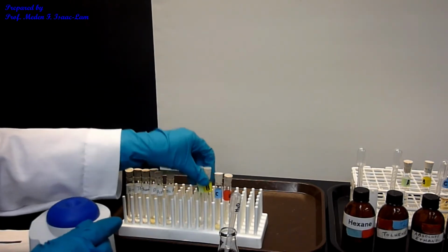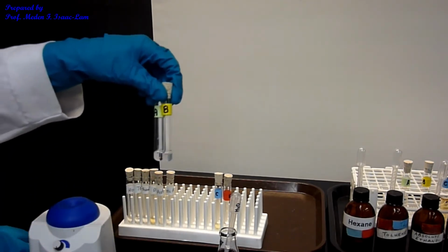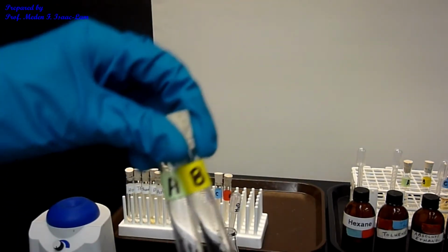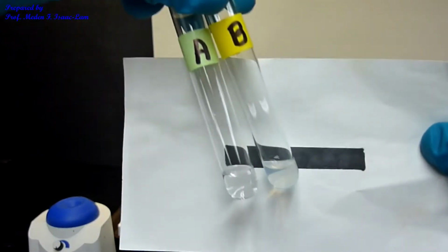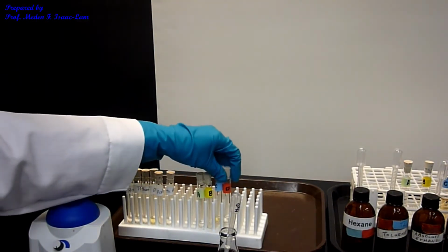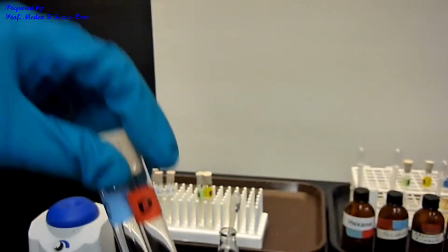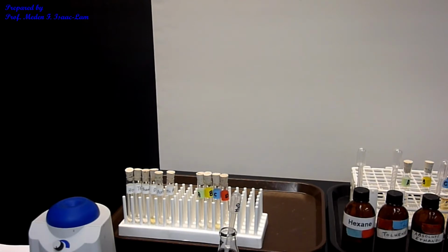So let's review the results. Unknown A and B are both soluble. And then unknown C and D, I also did not see any layer. They're both soluble. So all of the unknowns are soluble. That's it for part A.